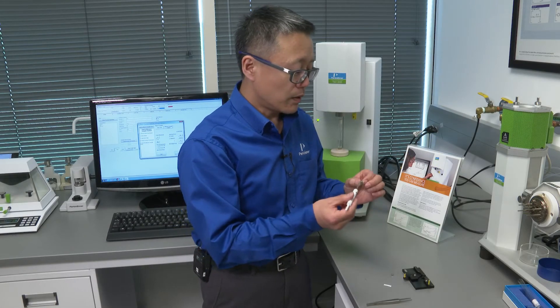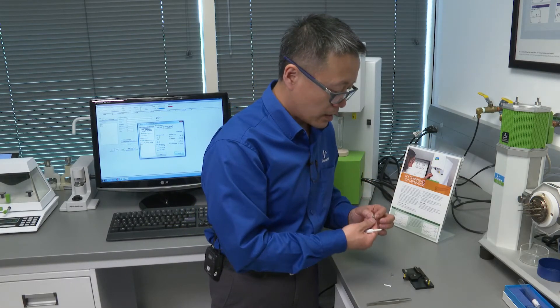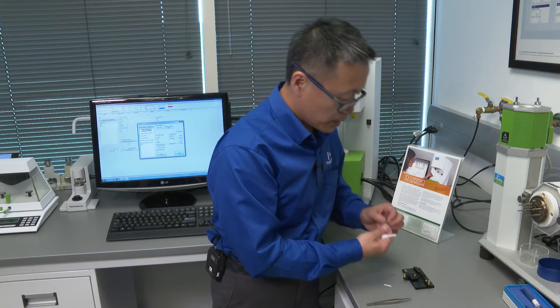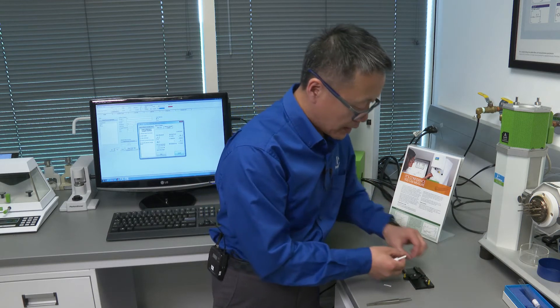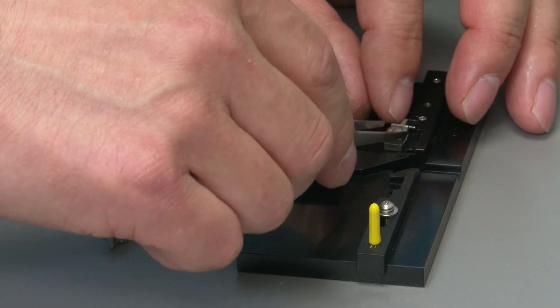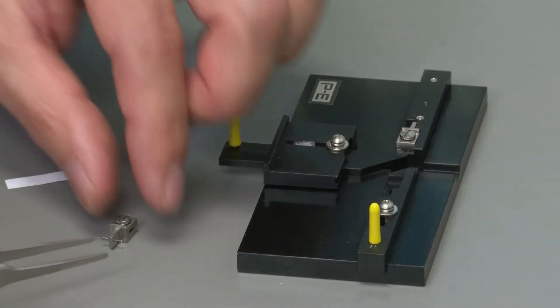First you want to unscrew these and loosen them up so it has an opening for the sample, and you want to put these two parts into this fixture.